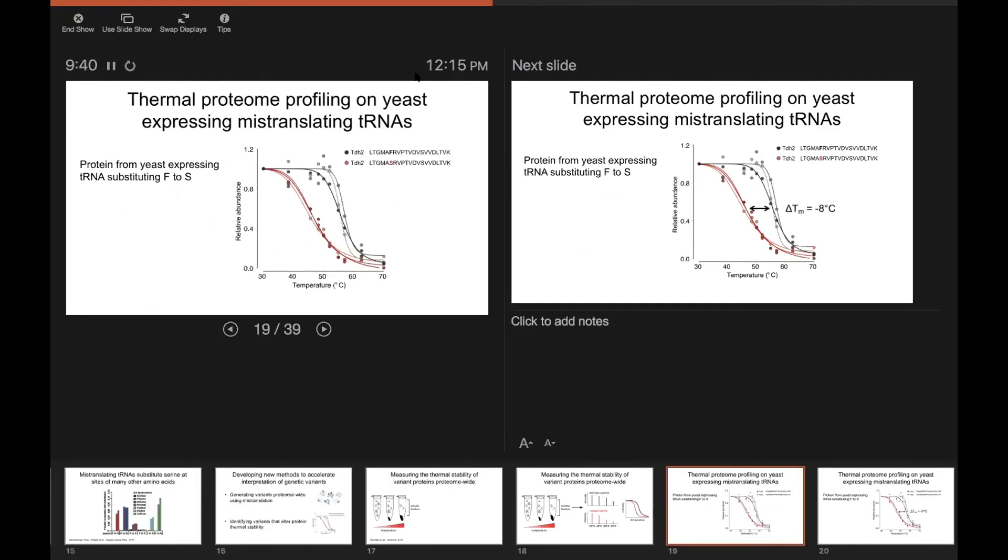So here's an example of how the real data actually looks. This is from a TPP experiment of three replicates on protein from yeast expressing a tRNA that substitutes phenylalanine at serine sites. And I'm showing one example peptide here from the protein TDH2.